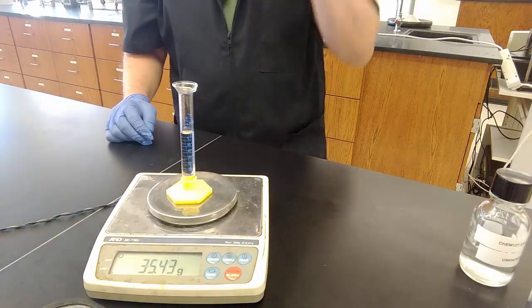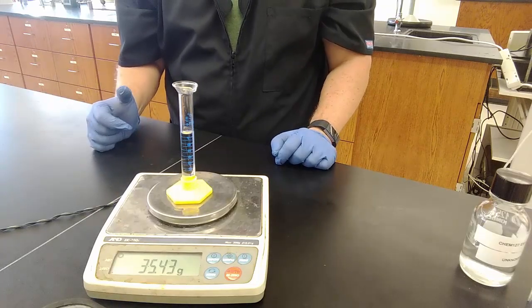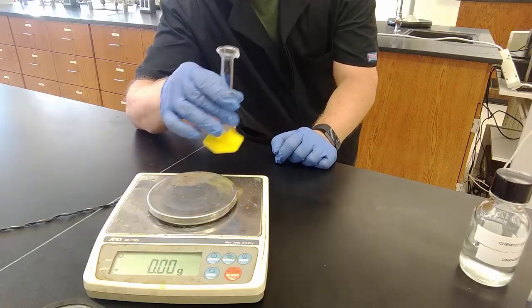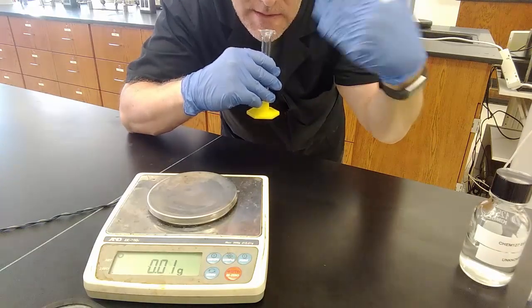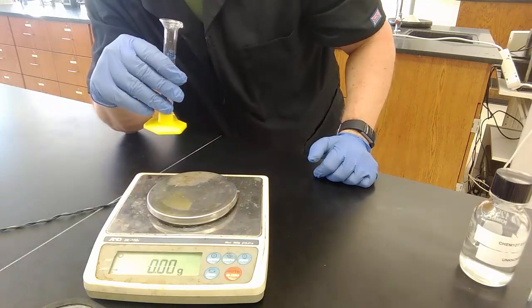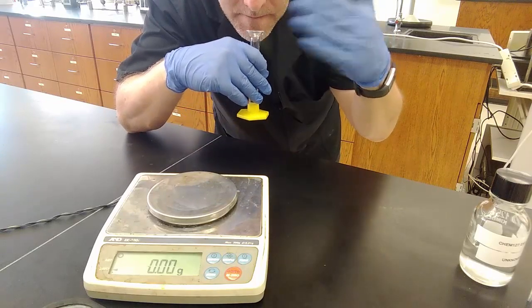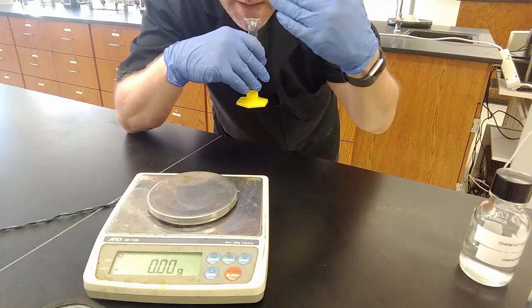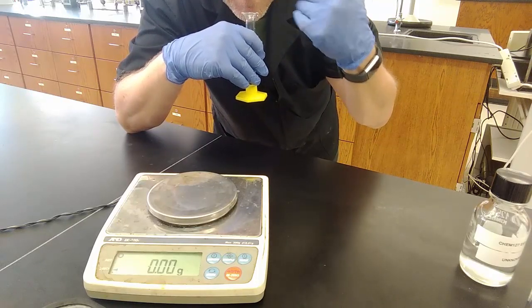Now, smelling, tasting things in the lab, putting them on your skin to see if they burn or feel funny, generally a bad idea. But we can carefully smell this and see if it's something that we might recognize. So I'm going to carefully wave this to my face, just to get an idea. Have I smelled this before? Now this isn't on your data sheet anywhere, but just going to have a second data point for us to know. And to me, this doesn't smell like nail polish remover. It kind of smells like vodka.